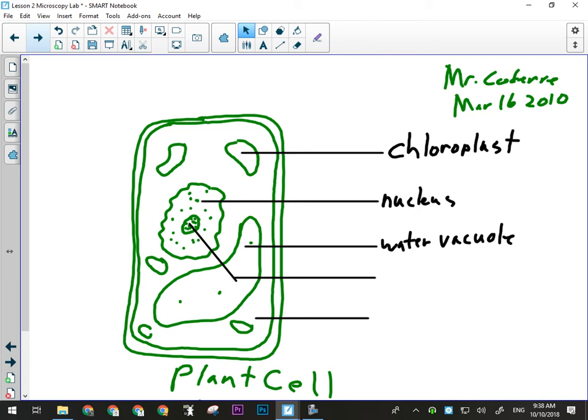Okay, you will have, for you guys, not a drawing, but the picture that you take centered, maybe slightly to the left of center on the page. Make it as big as you can. You want the picture of the specimen to be as large as possible without getting grainy, right? Because obviously that's a problem when you start blowing things up, is that they can get grainy. So make sure that it is as big as possible without getting unclear. All right, so you have that.